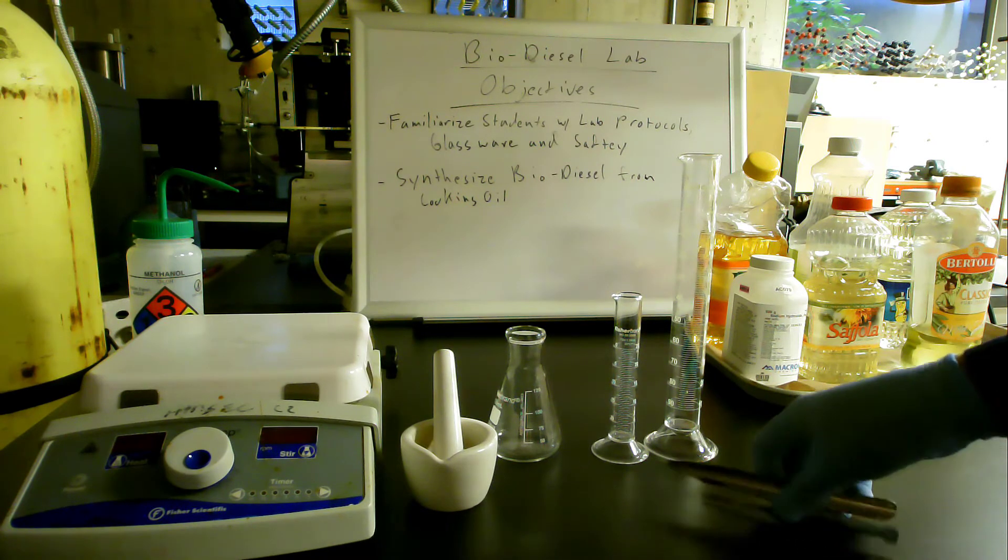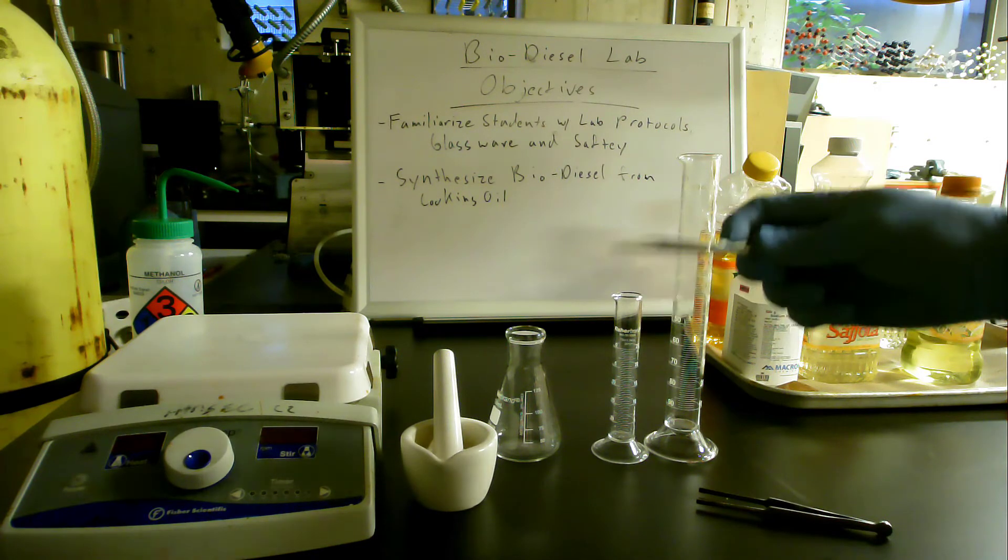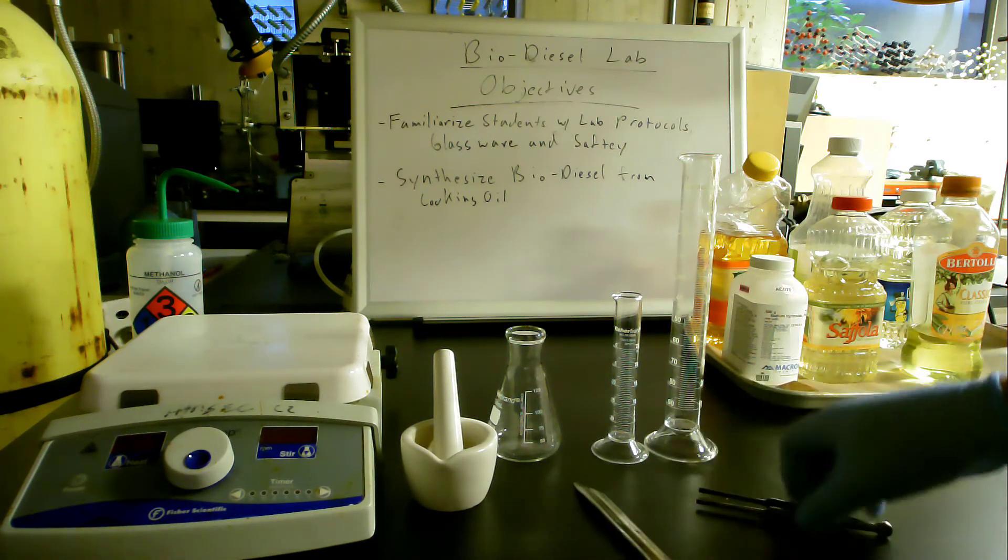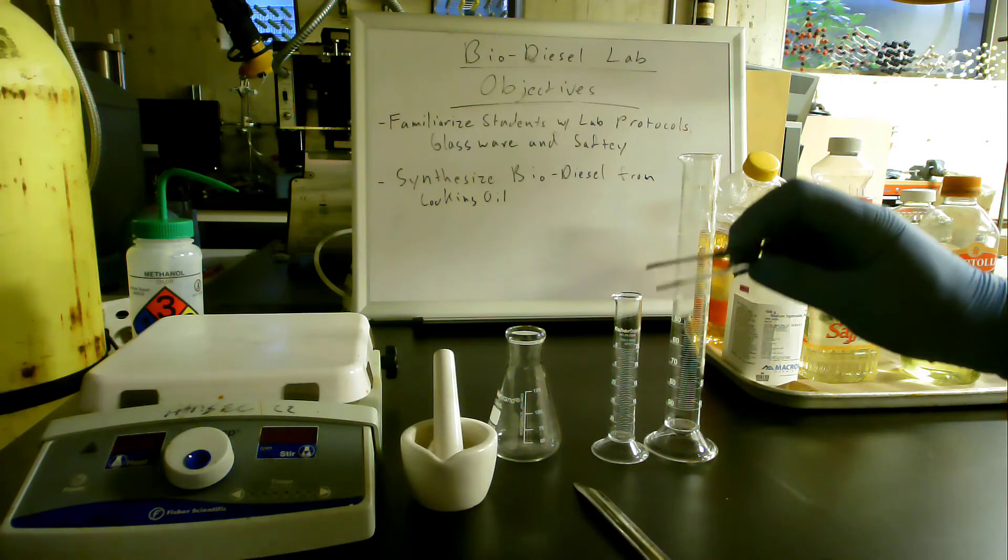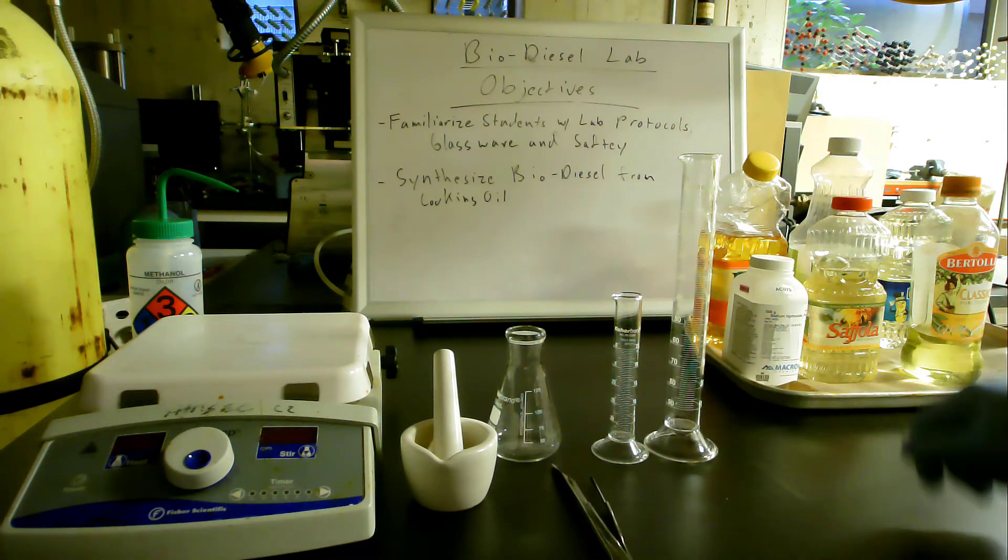We also have a spatula that's used to scoop out materials typically to weigh them. We also have some forceps which we will use to weigh out our sodium hydroxide.